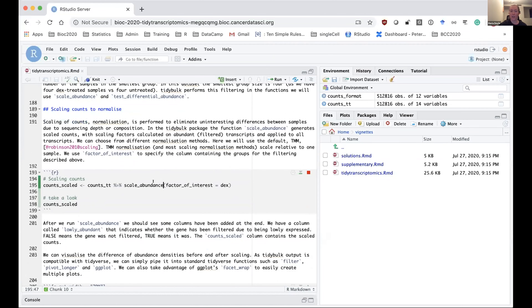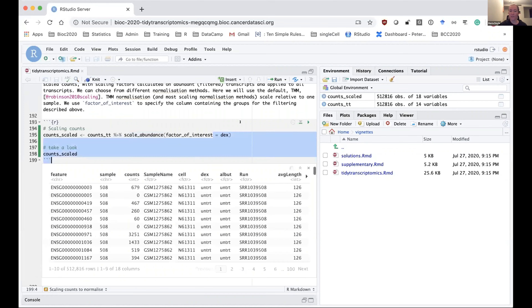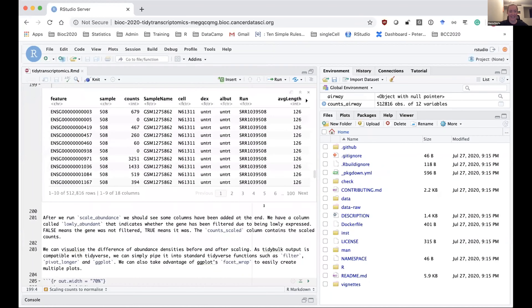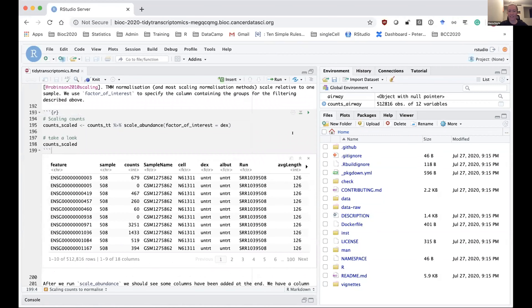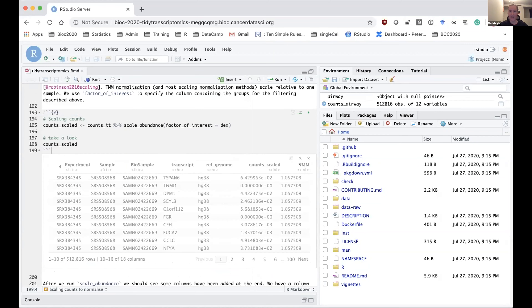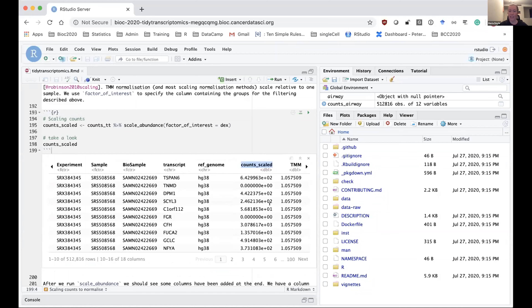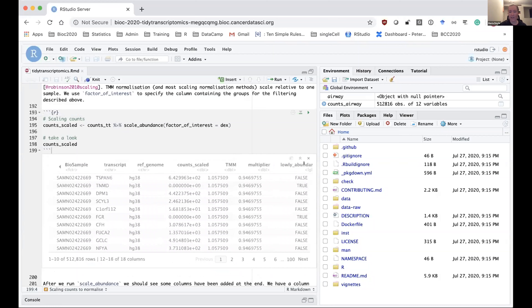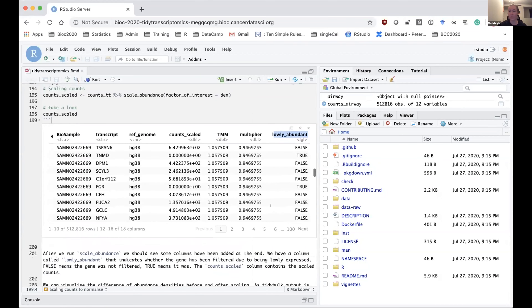We can do this with tidybulk using the easy-to-understand name, scale_abundance. For this function, we supply the factor of interest — the column that contains the groups — because it uses the edgeR method for filtering. After running the scaling function, we should see some columns added at the end: a column called count_scaled containing the scaled counts, and a column lowly_abundant, which indicates which genes are going to be filtered out for low abundance.